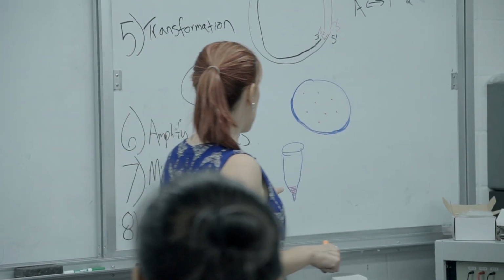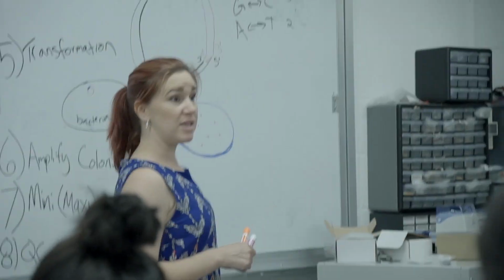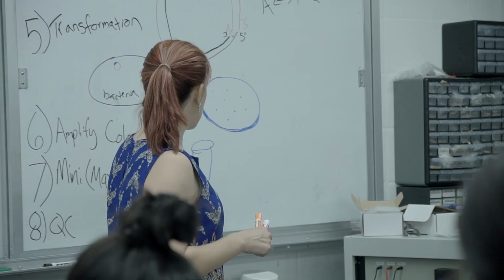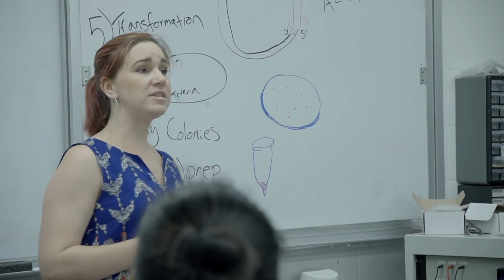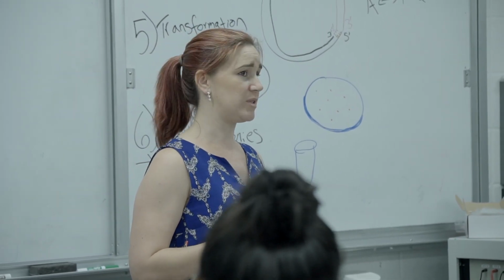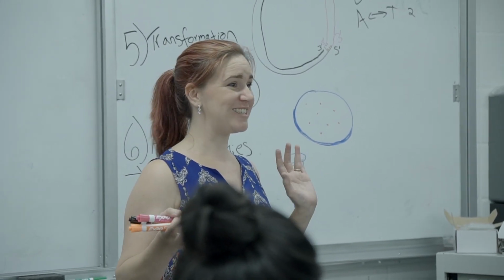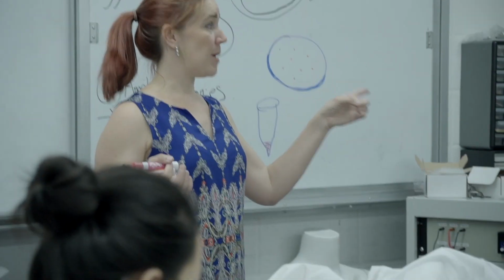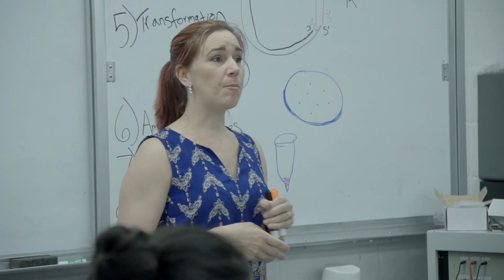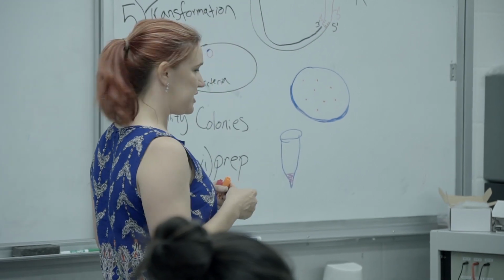And then the other thing I can do, which Mike talked about, is sequence this. So I can take a little bit of this plasmid and sequence it, and we did a reaction today that you can do for sequencing. What was that? It's not a restriction digest, but PCR. So what will I put into my PCR reaction for sequencing?